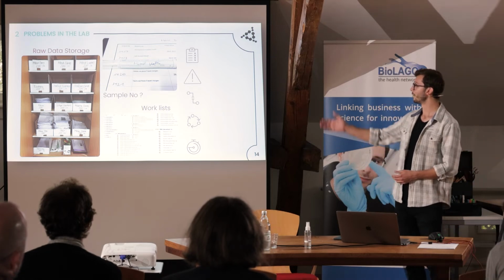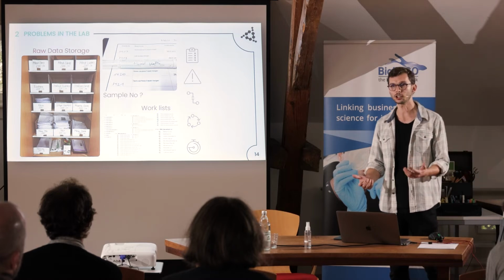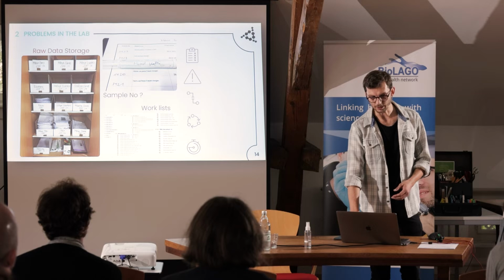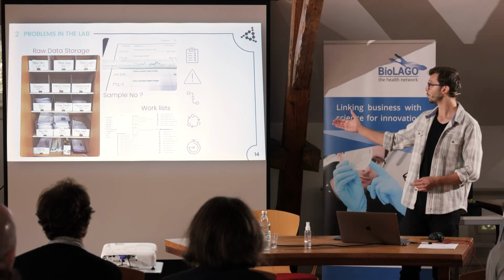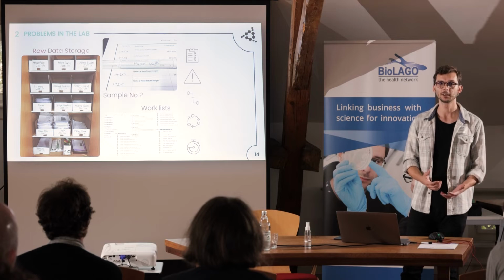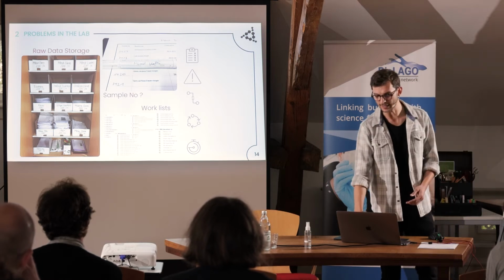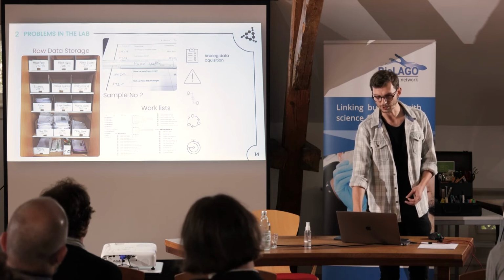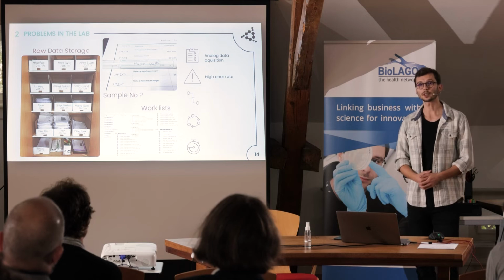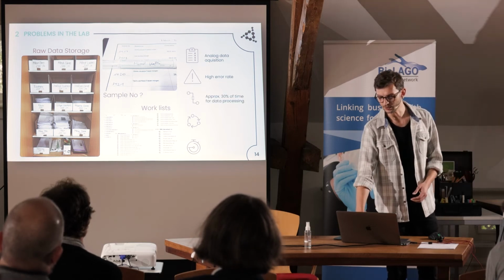And lastly, there is a variety of different work lists and spreadsheets, combinations from each of the team members or lab technicians. And if the one who made up a spreadsheet and did all the calculations retires, then no one knows how to work with these sheets or has control over them. So how can we control higher error rates in laboratories, how do we know when we made a failure in some data?